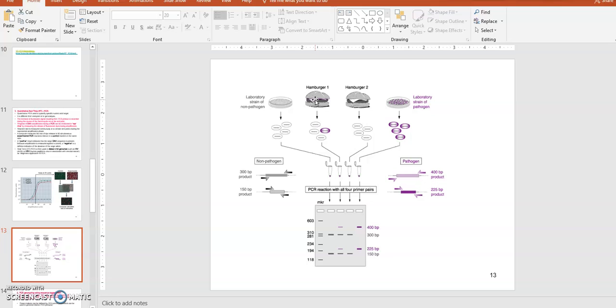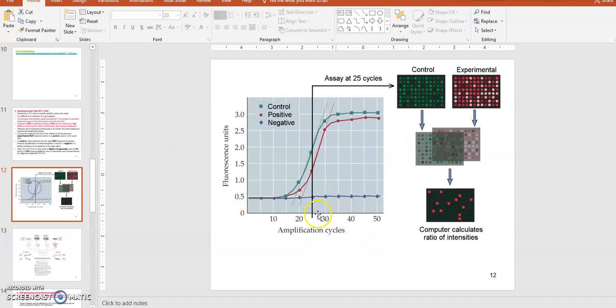You're trying to see if there's some food poisoning happening at restaurant businesses, right? Then you will compare samples taken from these food materials against the negative control and positive control, and you'll try to quantify how much PCR product you make, just like this curve.